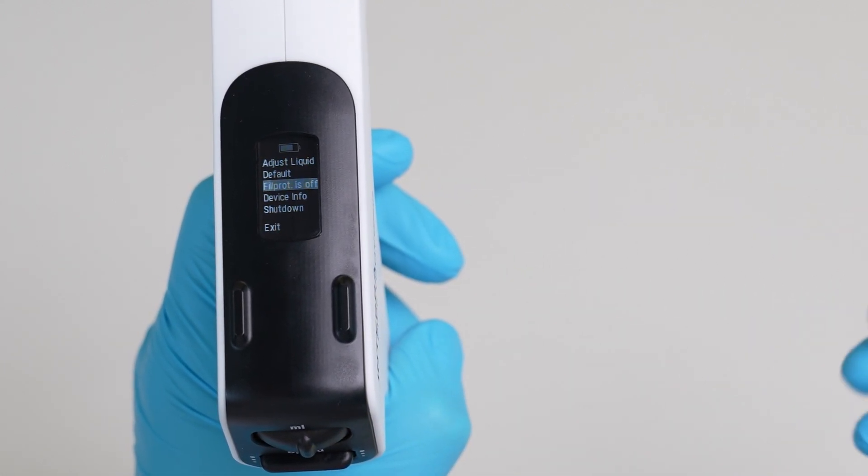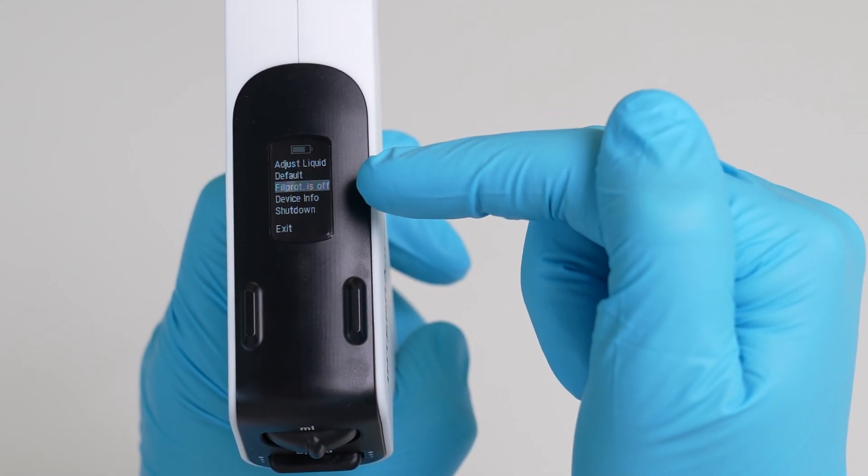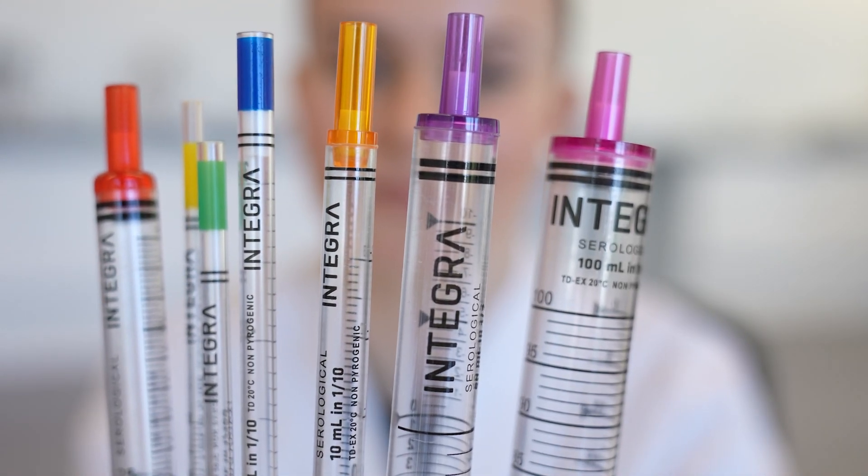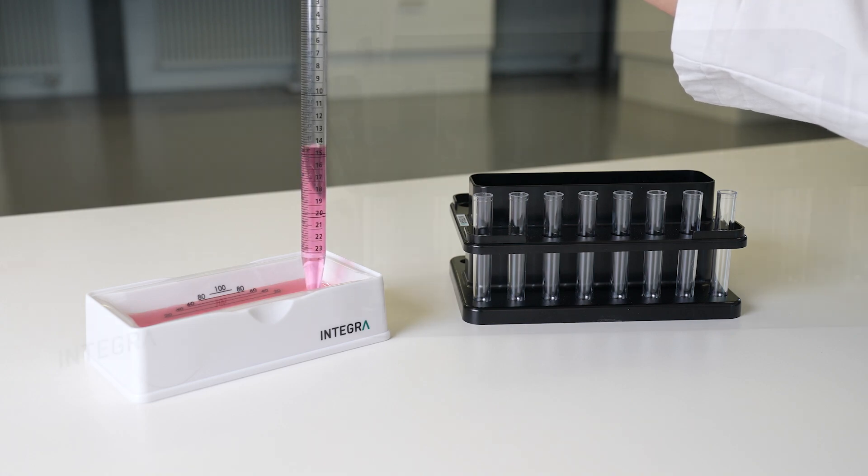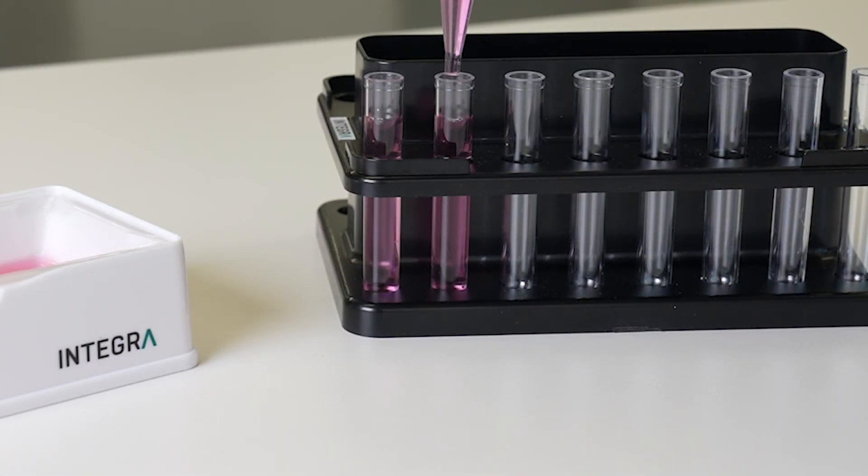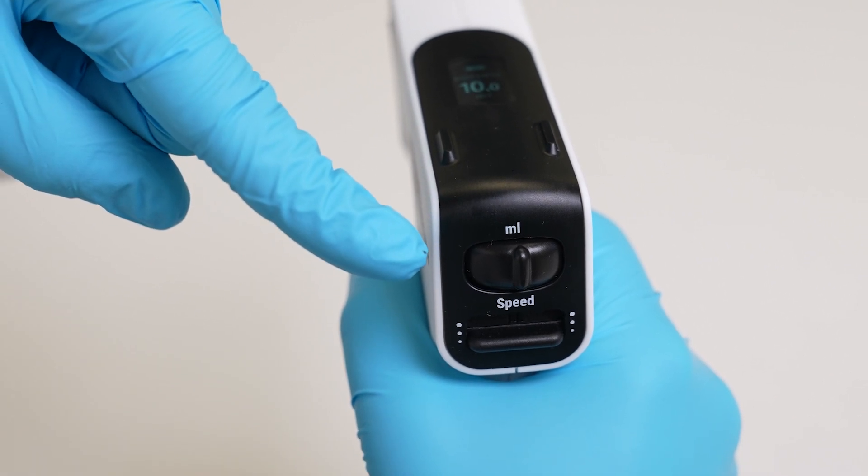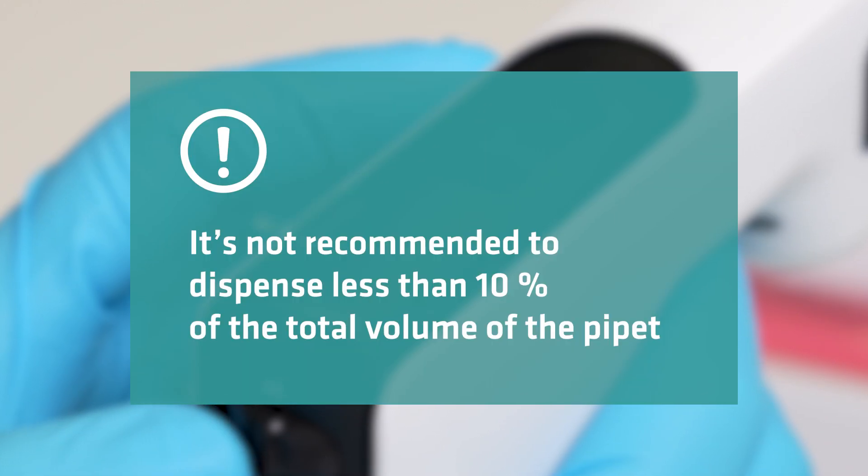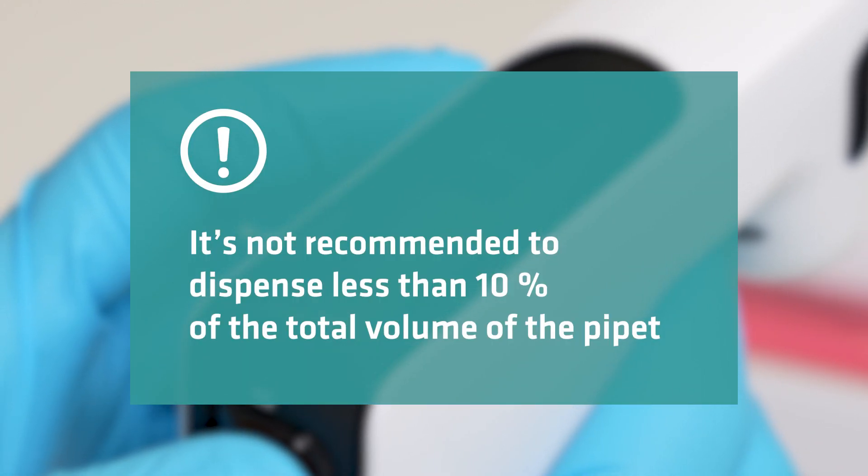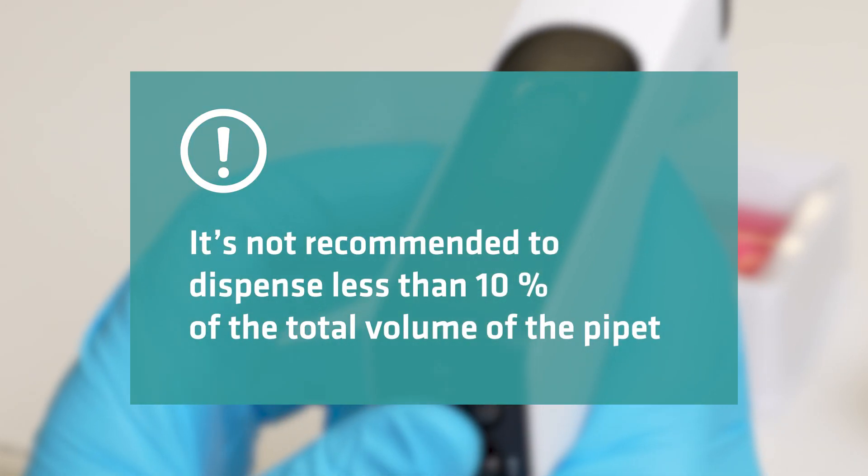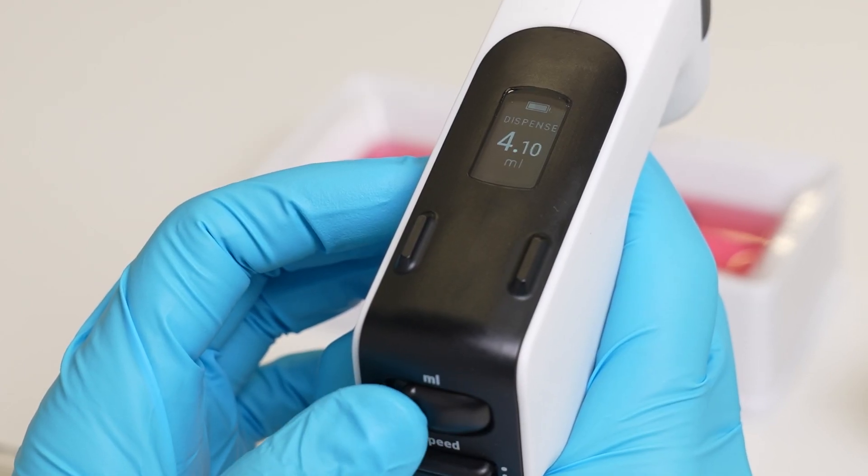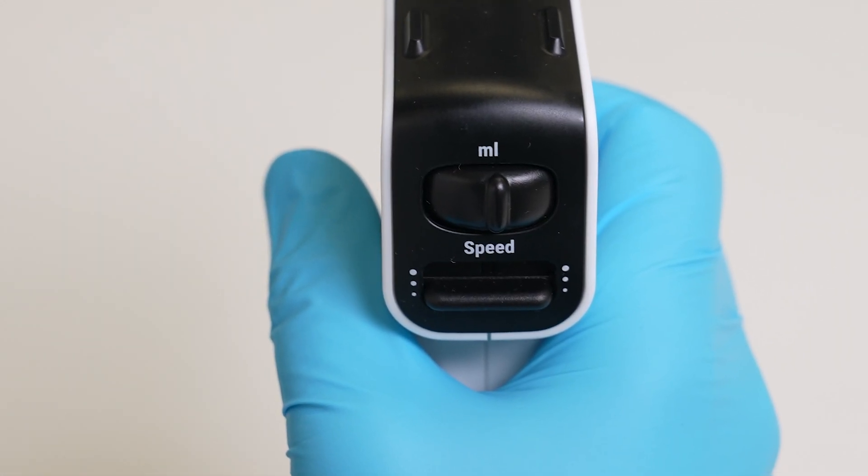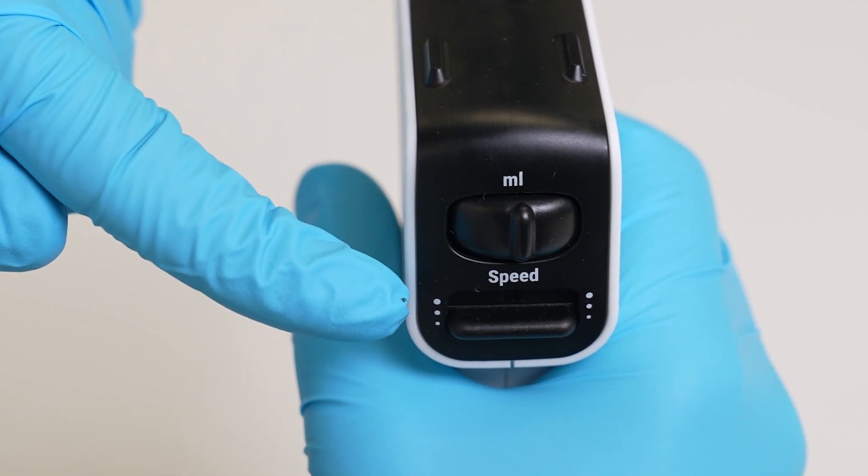Combining the Pipette Boy Genius with any Integra serological pipettes allows you to work with the powerful repeat dispense mode. The volume wheel sets the volume of your dispense aliquot anywhere between 0.1 to 50 milliliters. It's not recommended to dispense less than 10 percent of the total volume of the pipette since this can affect the accuracy. After setting your dispense volume, choose the speed using the slider. This is the set speed for the dispense and can be changed between dispenses.